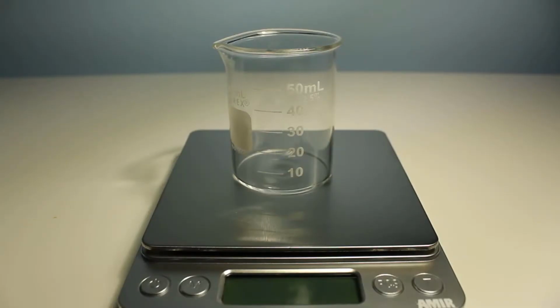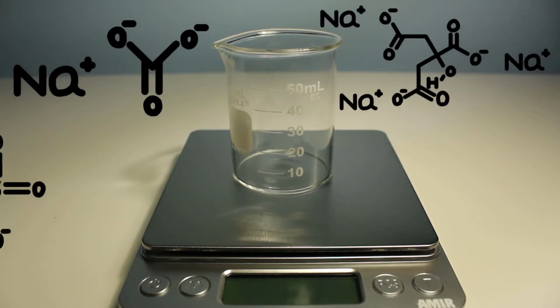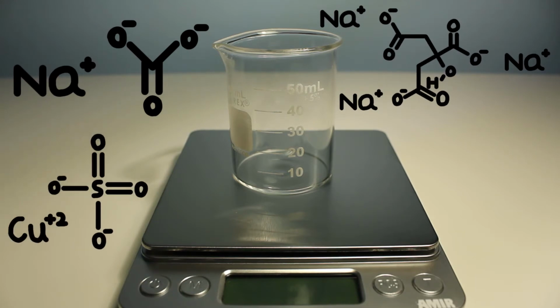Hello, today we're going to be making Benedict solution. It's a solution used to detect monosaccharides in liquids. The ingredients required to make this solution are sodium carbonate, sodium citrate, and copper sulfate. Copper sulfate pentahydrate can also be used and is most commonly used as it is the most widely available.